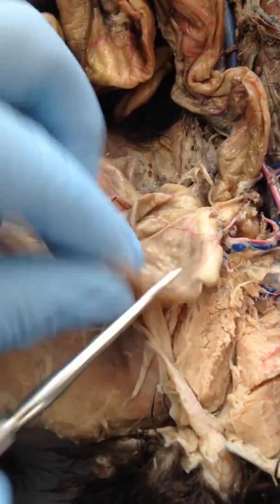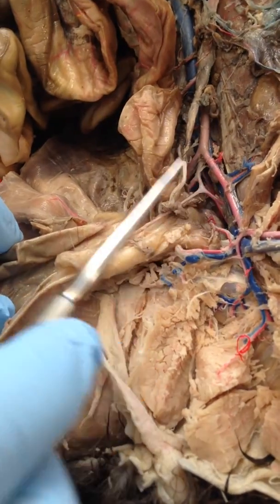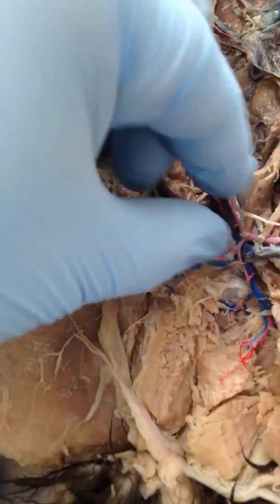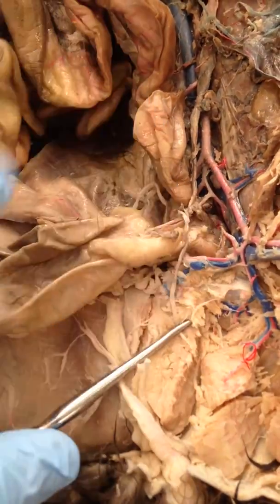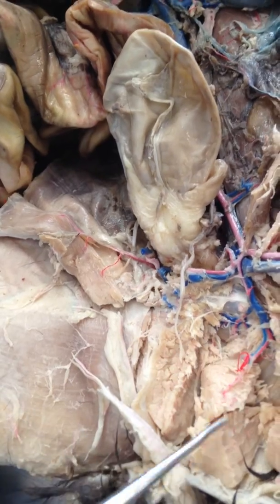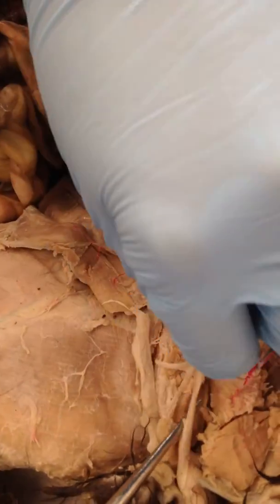There should be one looping from the other side. Let me see what's there. Oh, it has been severed. Yeah, so he's had a vasectomy on that side. So those are the two vasa, and this one's gotten cut. This one is attached to this right there.